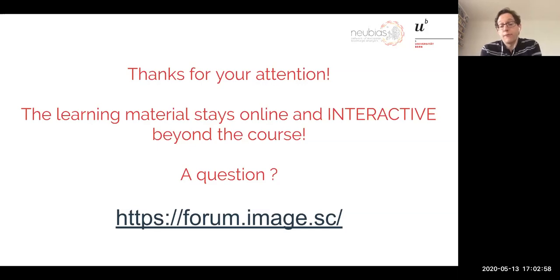If you have fluorescent nuclei, you can try to use it and see how it performs. If you have completely different data, you will have to retrain it, and they have some instructions on their website on how to do that.